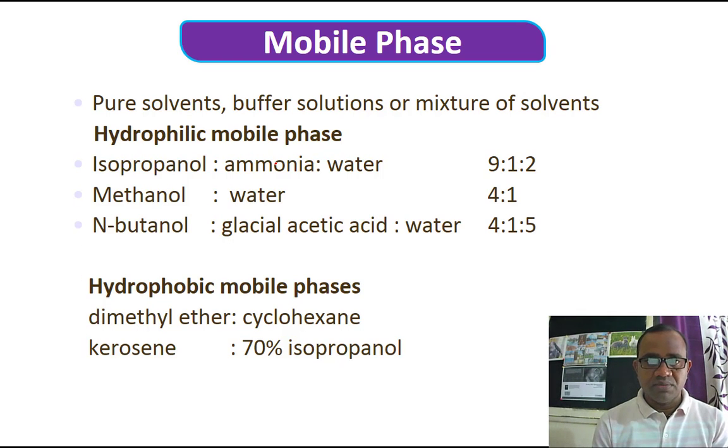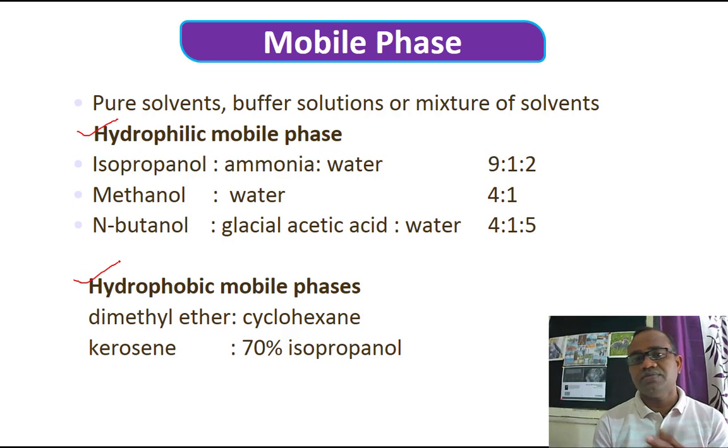This is the main important factor, that is the mobile phase. Mobile phase, generally the solvents or the buffer solutions. Okay, we have two types: hydrophilic and hydrophobic. Based on the solubility of the sample, we can use any one of these particular mobile phases.